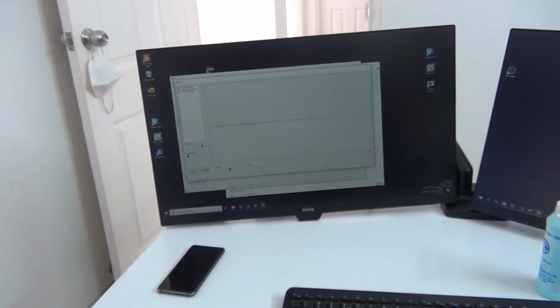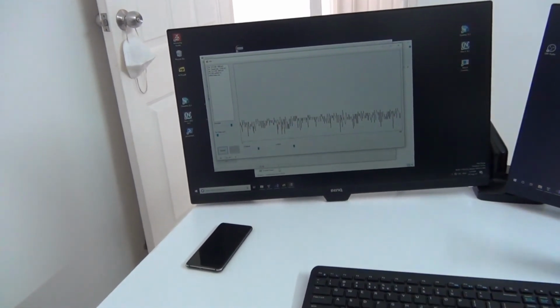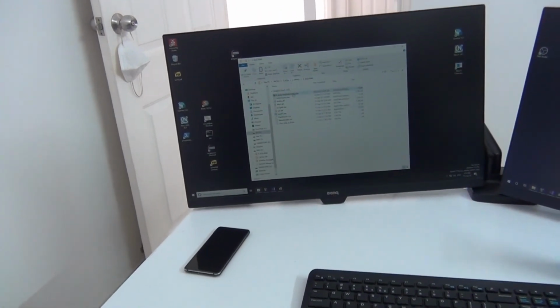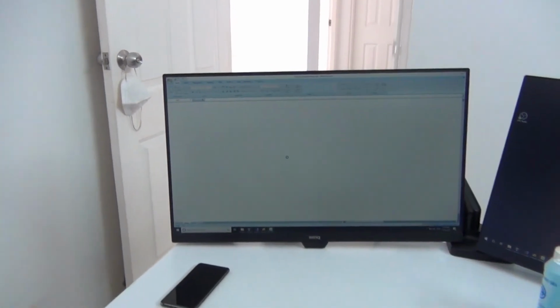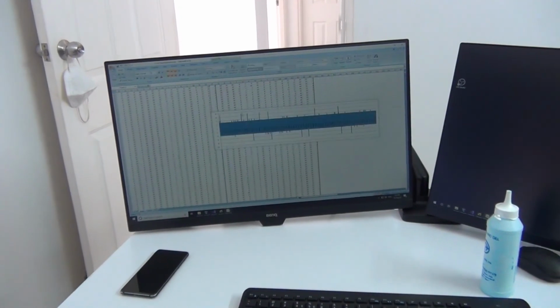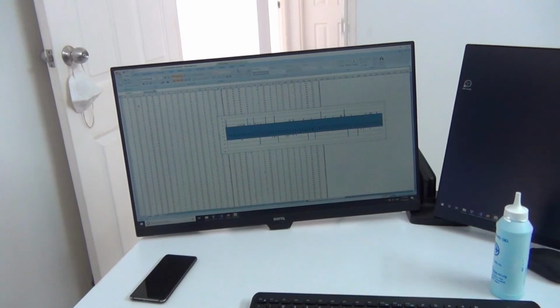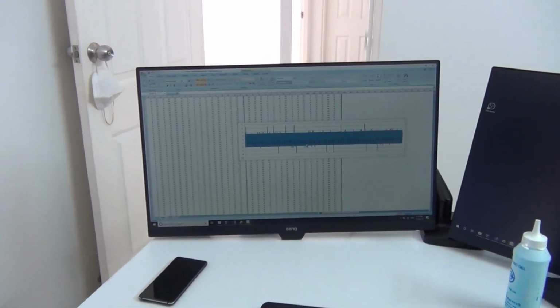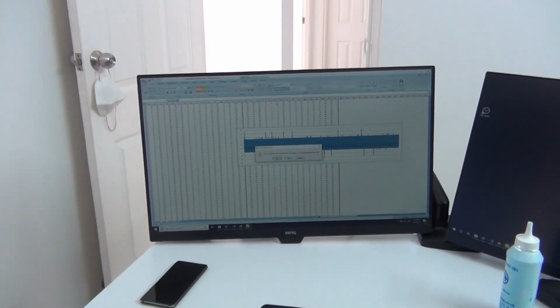This is the signal. Now I can do the same dump data. This has been dumped to a dump.raw file. Now again using the same tool I can view it. Okay, so this is the data, 4 to -4, almost no signal from channel 0 to 32 channels. So if there was a laser excitation, we would get a nice waveform here. So that's it. We have covered all the features.